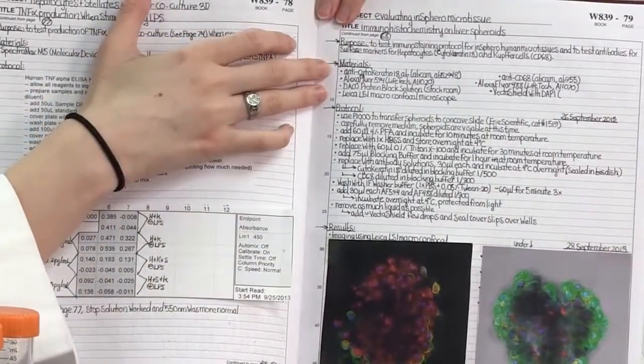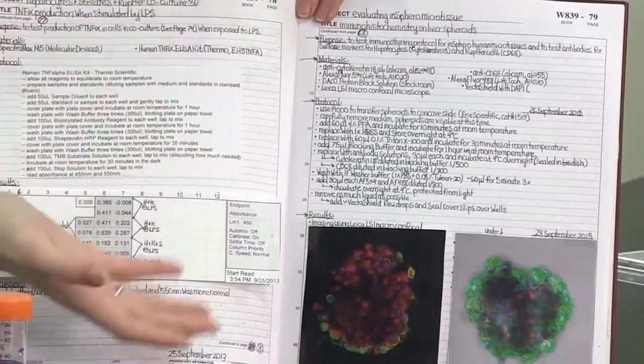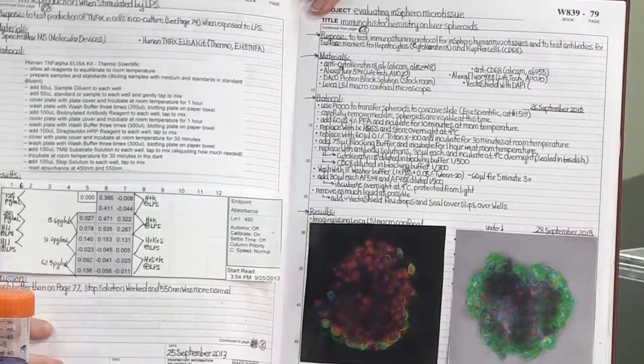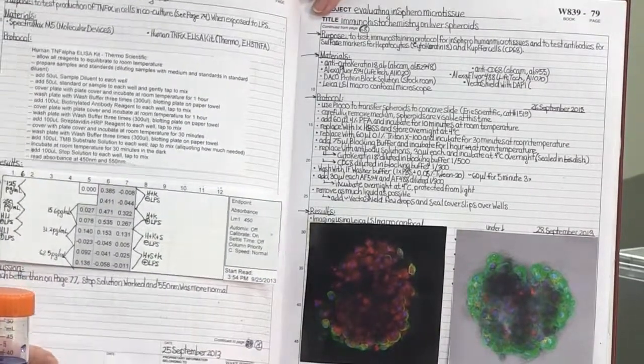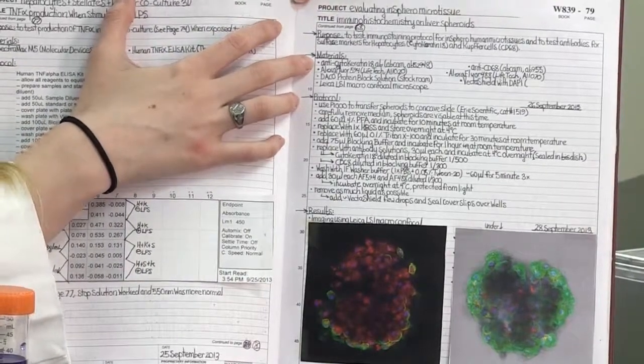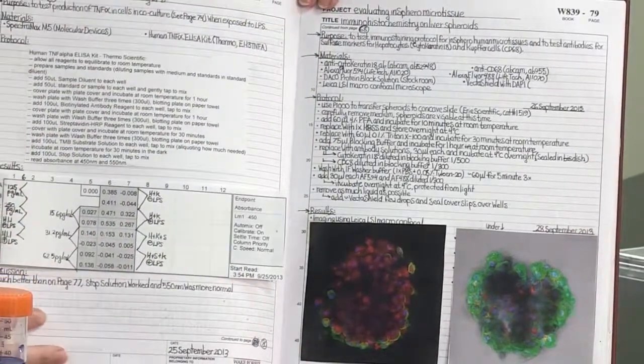It's also really important to note down which materials you use because oftentimes there are hundreds of different medias you can pick and choose from and hundreds of different antibodies and so forth. So it's really helpful to have the name of whatever you're using as well as catalog numbers and lot numbers.